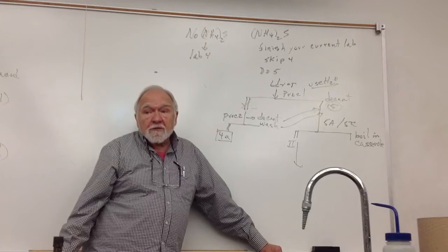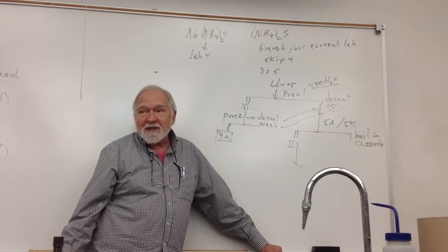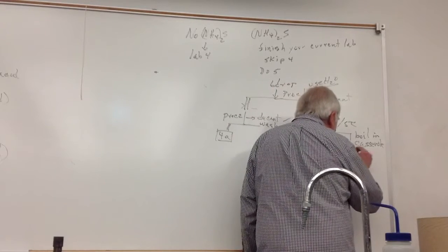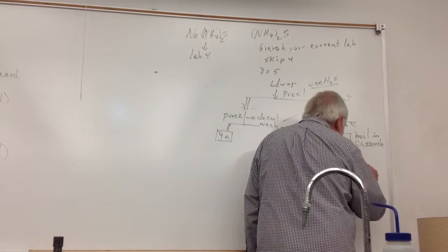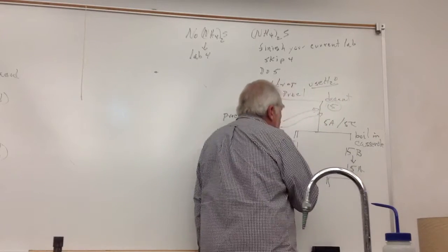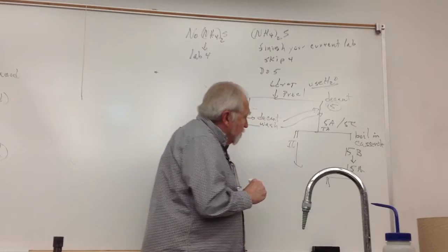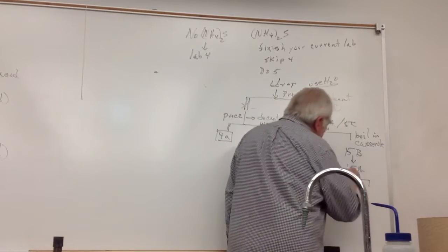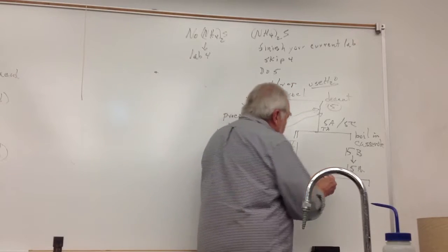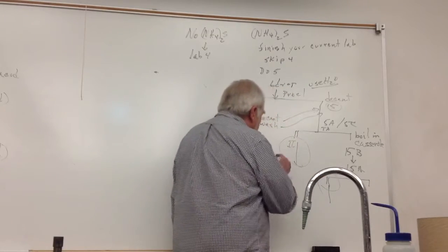When you get to procedure 15, part B says boil in the casserole till you get down to 5 or 6 drops. You combine it right there. Now here you're treating with the thioacetamide, if you remember, in procedure 5C. That precipitates all your group 2. When you do 15A, you're adding ammonia, then you're adding ammonium sulfide. If this is a large precipitate, you continue here, whichever one has the larger precipitate.